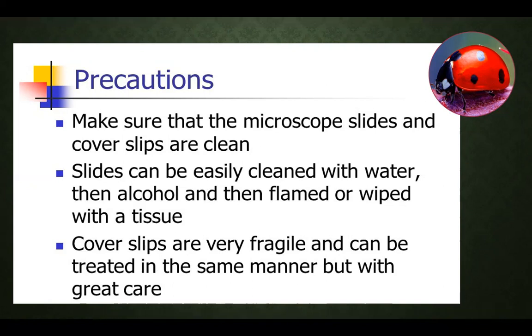One thing which is not mentioned here is the sterile conditions. It is very important to maintain sterile conditions while handling animal tissues. Particularly when you are using any kind of animal tissues, it is very important to maintain sterile conditions. While making human cheek cells, you don't need to scratch very firmly. It should be a very gentle scratch, so that it does not harm the inner lining of your cheeks.